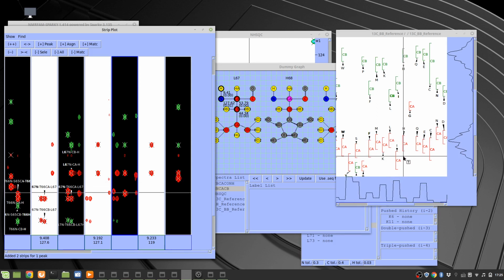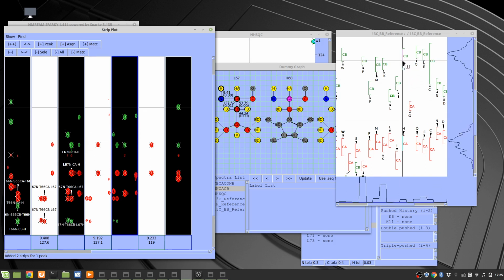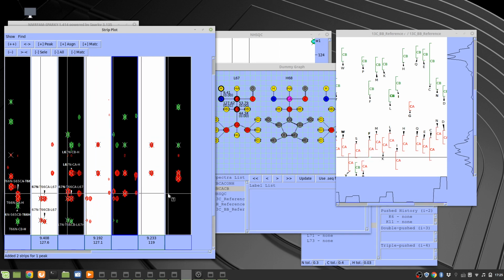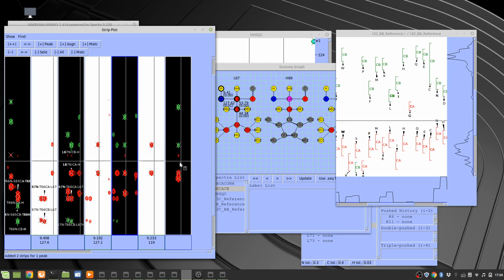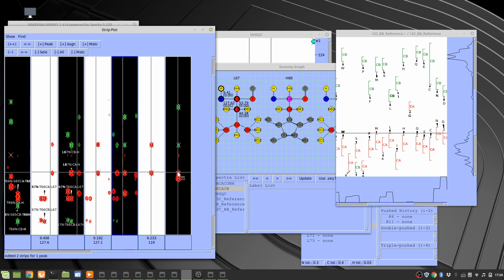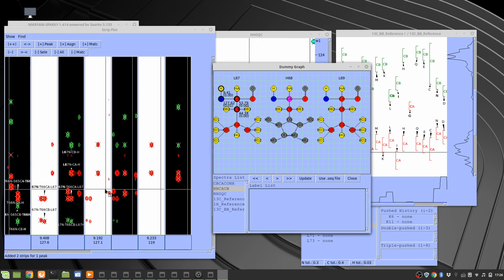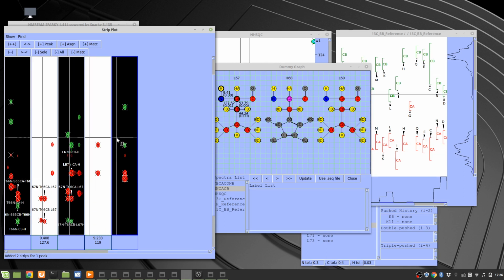And this one is outside. And if we put our cursor on beta here, this one is within the range. This one is also outside. So I would say this one is more like it according to the statistics. So what I would do is assign this one as histidine 68 and then bring up the next matching strip to see if that is more like a leucine 69, right? So I will remove this two first and then bring the next strip.